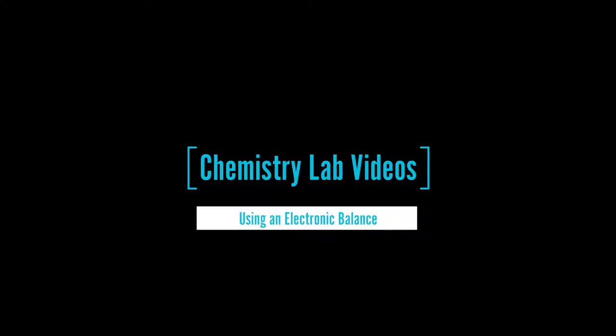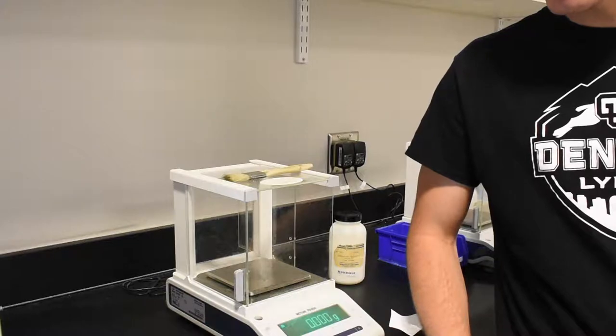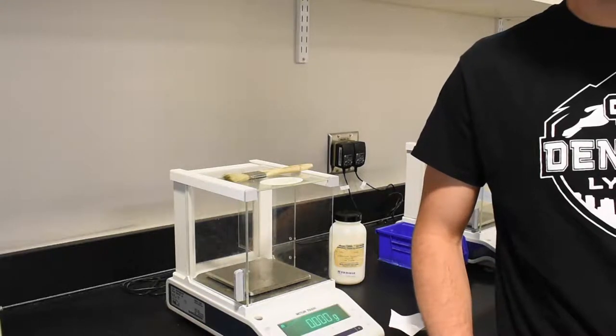Welcome to General Chemistry Lab Videos. In this video, we're going to be talking about how to use an electronic balance in the lab.